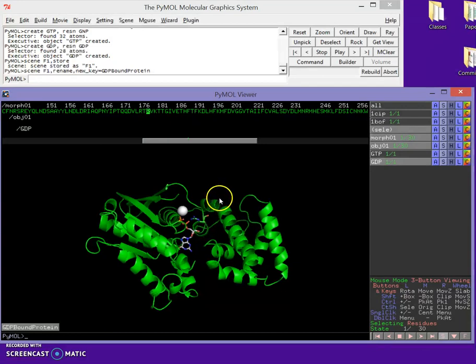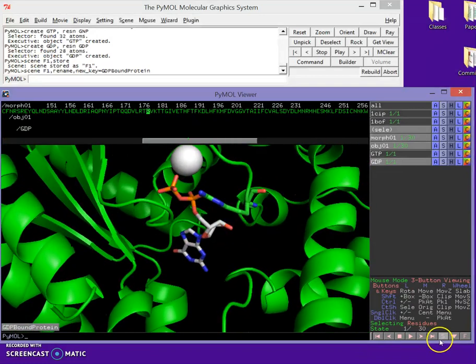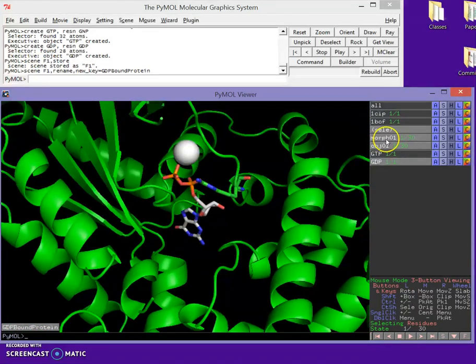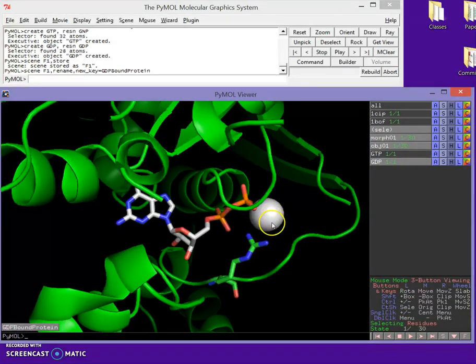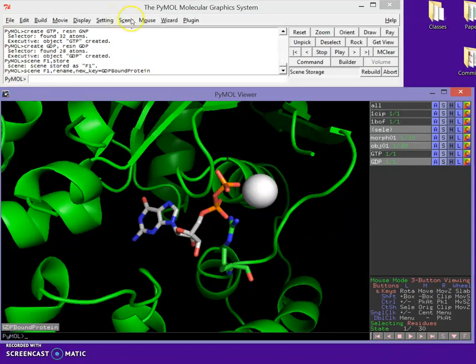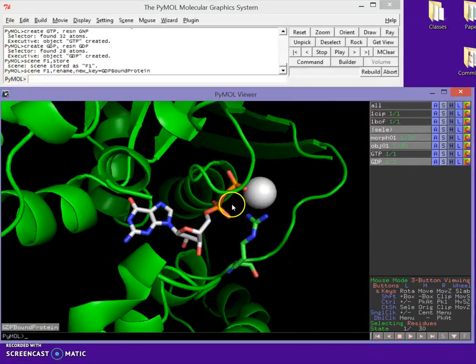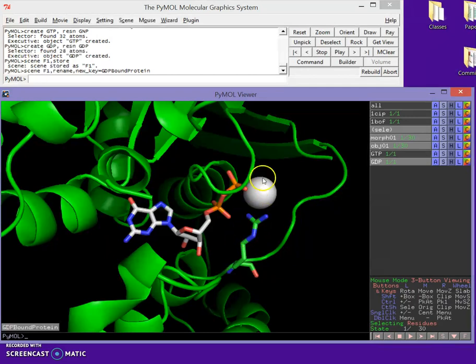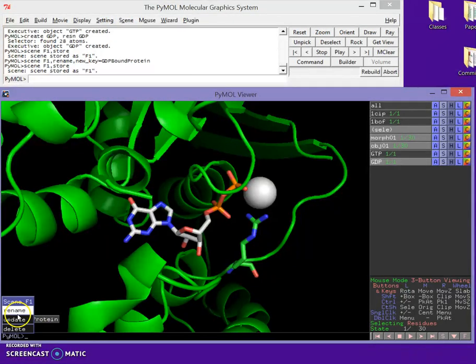You might also want to zoom in on the active site since that's where the business happens. I'll orient on my GDP object and scroll the mouse wheel to adjust my focal plane. That looks pretty good — you can see the phosphates coordinated to the magnesium and the arginine as well. I'll store that as a new scene and rename it 'GDP active site'.